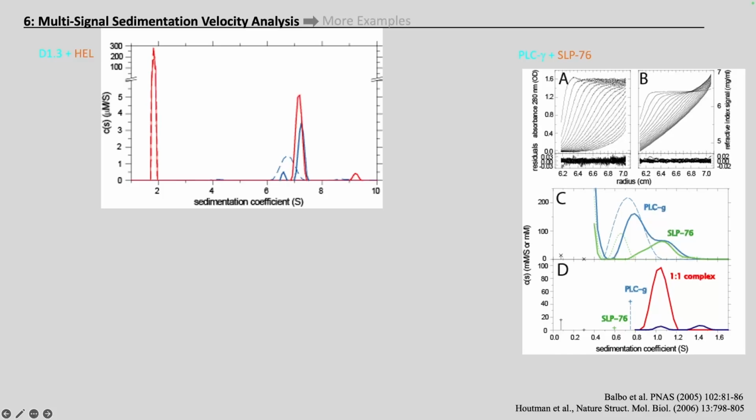And using the predetermined extinction coefficients from control experiments, we can analyze the mixture with lysozyme in excess over antibody. The solid lines show the component sedimentation coefficient distributions in red for lysozyme and in blue for the antibody, in molar units. You can see, for one, that the S value has shifted. Clearly complexes have formed. And from integrating over the two peaks, we can confirm that there's about twice as much lysozyme than antibody in the complex, which therefore confirms the expected 2-to-1 stoichiometry.